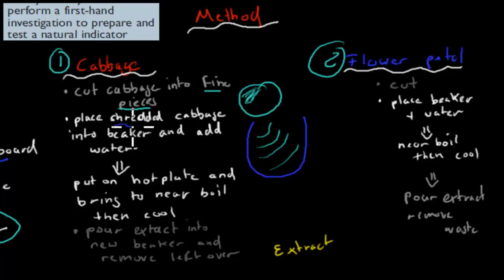So take the shredded cabbage, put it in the beaker, and we add some water. Then put it under the hot plate, anything that gives you a flame and produces heat. Place shredded cabbage into a beaker and add water. Then put it on a hot plate and bring it to near boil. Once it's at that stage, you take it off and allow it to cool.